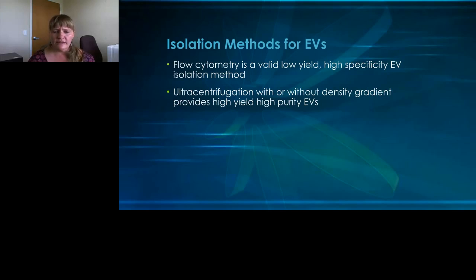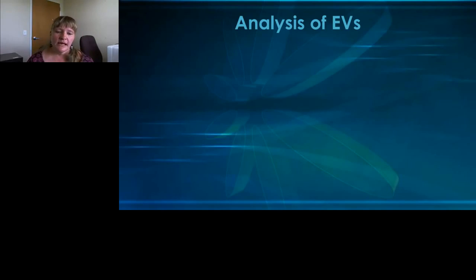It is all well and good to isolate EVs using this method, but when I look at a tube, I can hardly see that pellet, much less understand what is inside it and its concentration. In the next section, I discuss the methods of analyzing the EV pellets and sample using current and new techniques. There are many methods to analyzing EVs after isolation. I'm going to include a few of the many methods.